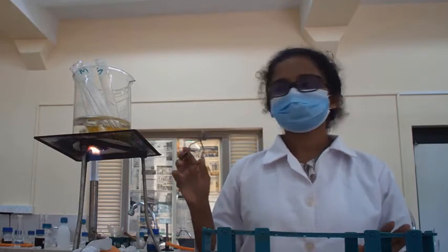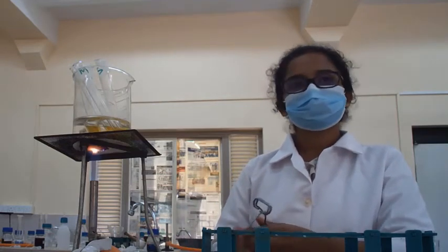Now we have kept our samples in the water bath for about 30 minutes, and you may see crystals are formed in these test tubes. It's better if you could notice the time taken for each solution to make the crystals.